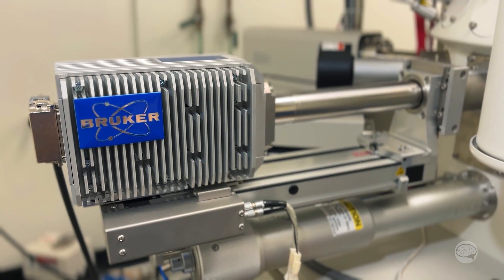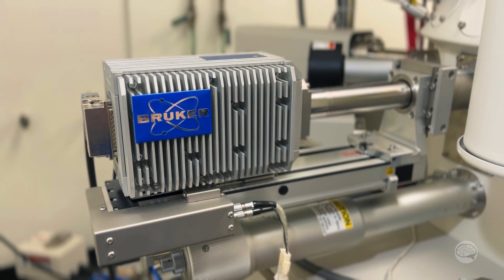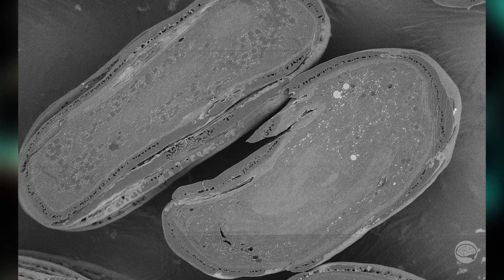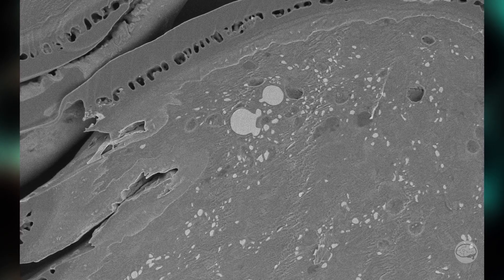Well, how do we find out? It's easy — we insert the Bruker FlatQuad Energy Dispersive X-ray Spectroscopy detector. Once it's been inserted, the FlatQuad will give us good EDS signal even while running at very low voltage and low current. I'm running this at six kilovolts and in a very low current condition to minimize charging on this uncoated biological sample under high vacuum.